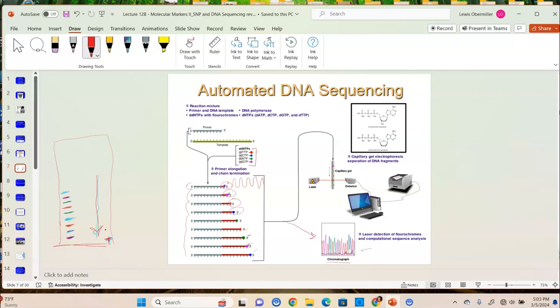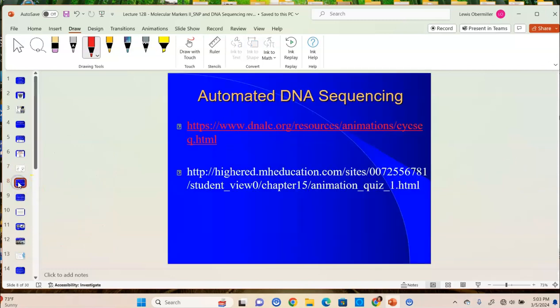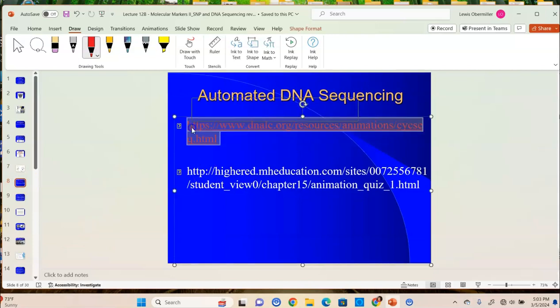And so once the laser has detected this, and this is showing it going through a capillary gel instead of an actual full slab gel. These are actually easier to manage and easier to pour than those big gels. So anyway, we just do the same thing. The machine automatically reverse complements the sequence and you get your sequence.